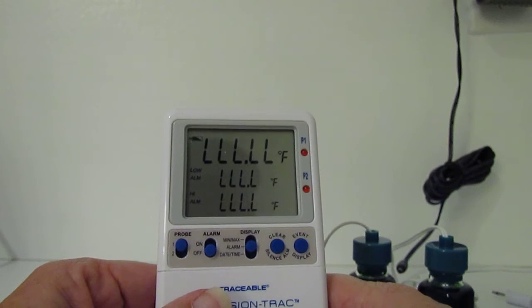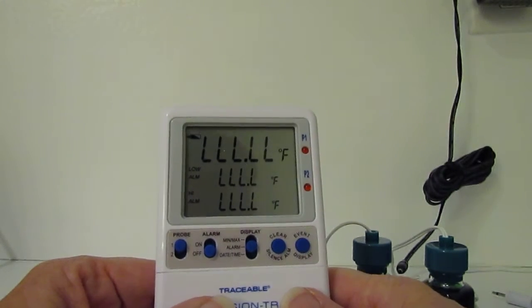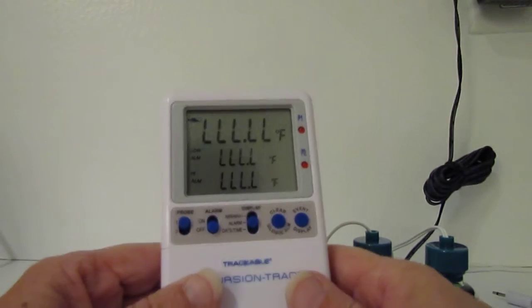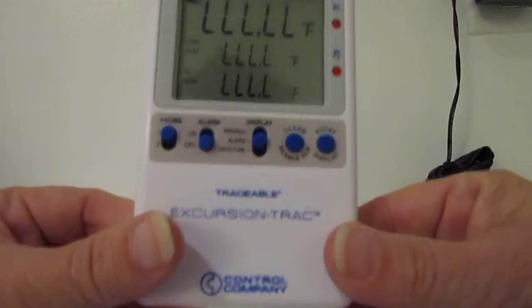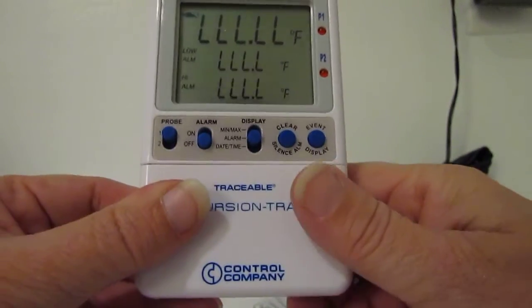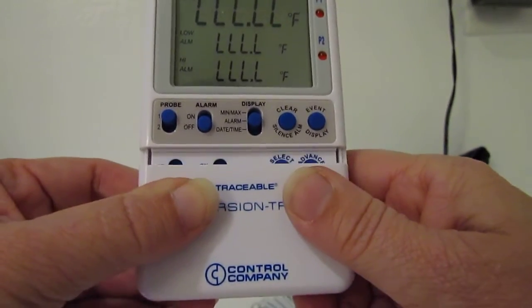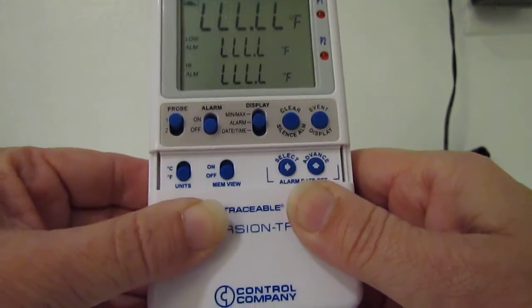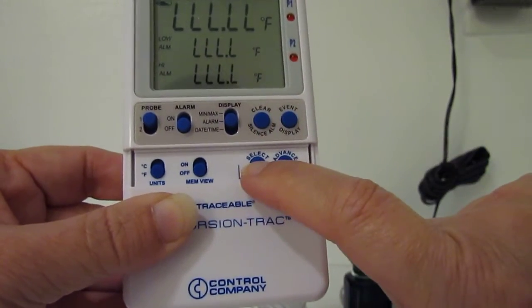The next thing, if you look at the directions and it tells you to set the date and time, it tells you to press the select key. But if you look here, you don't see a select key. If you look up on those directions, you'll notice that there's a little door here that you can slide down and there is your select key.